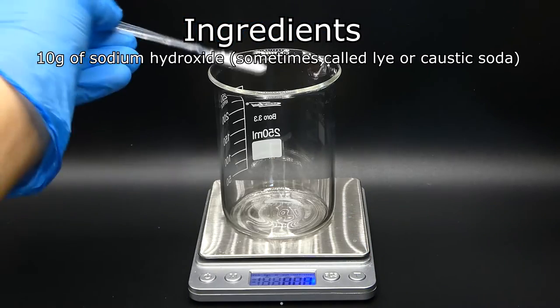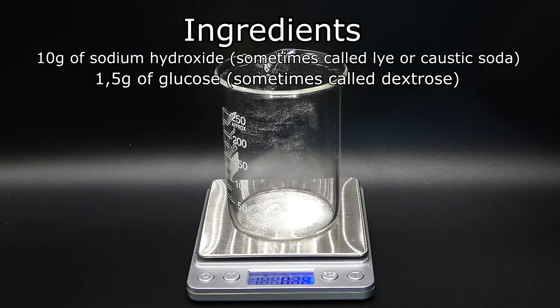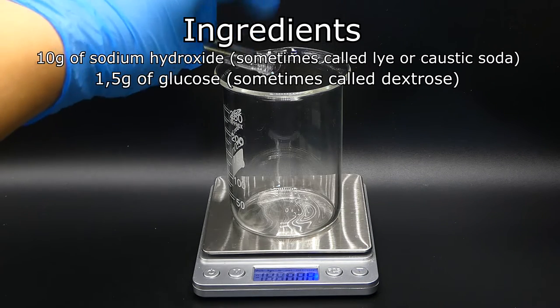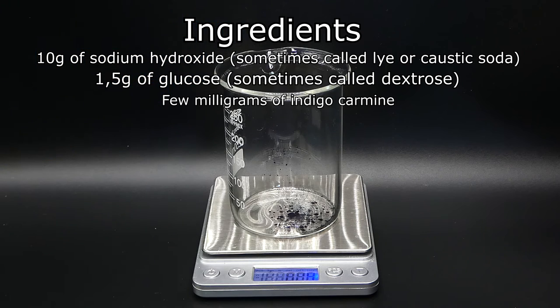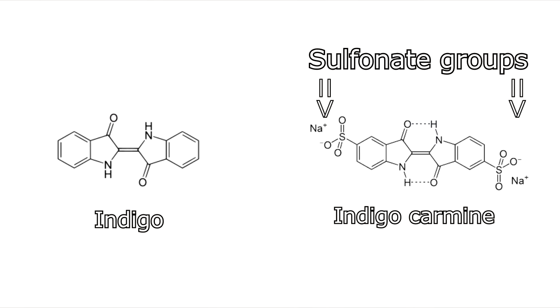Ten grams of sodium hydroxide, 1.5 grams of glucose, and a tiny amount of a dye called indigo carmine. All of these can be easily purchased from a chemical supply store. The indigo carmine is a water-soluble version of the popular dye indigo used in, for example, dyeing jeans. The indigo carmine is a little different on a molecular level, and that modification makes it safe to use as a food coloring and able to dissolve in water.